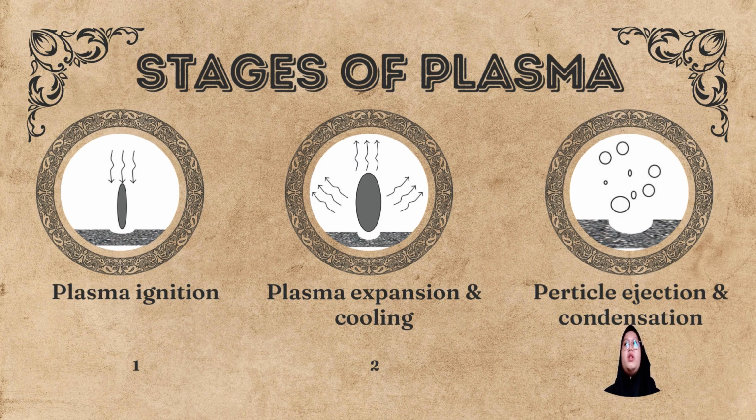Hence, this amount of material is ablated as a particle and then creates a condensed vapor, a liquid sample ejection, and solid sample exfoliation, which do not emit radiation. Moreover, ablated atoms become cold and create nanoparticles in the recombination process of the plasma.